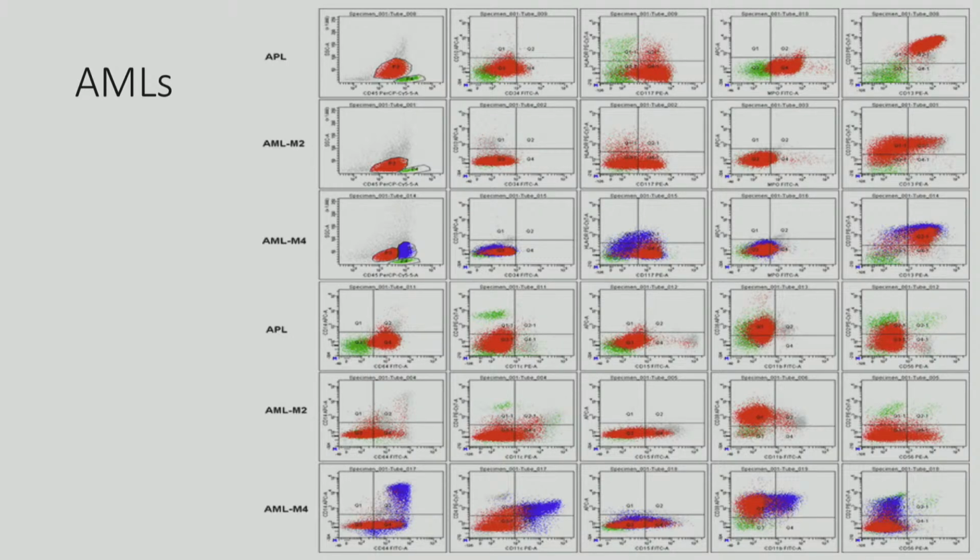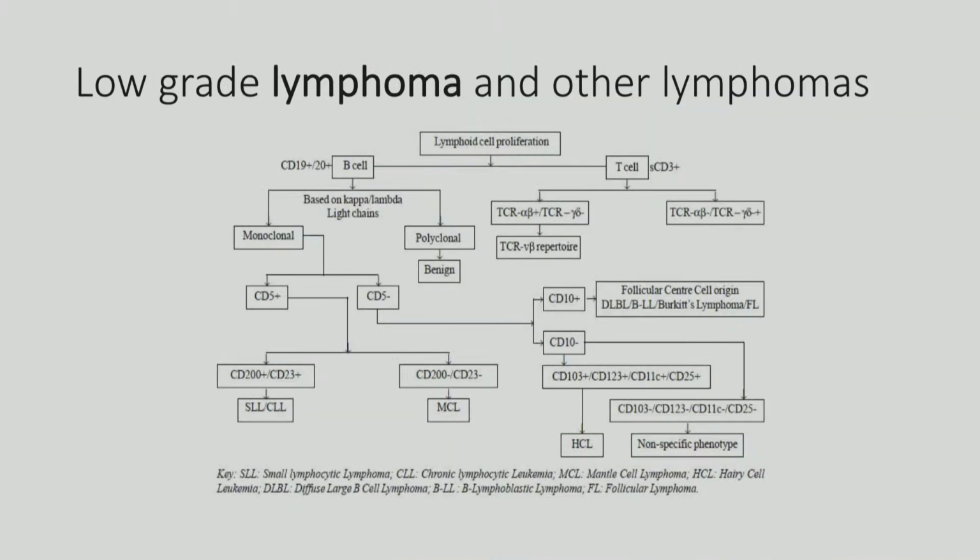But we can have clues of different leukemias, and flow cytometry needs to be interpreted along with genetic analysis. Say we order a cytogenetic analysis, basic karyotype, fluorescence in situ hybridization, and nowadays various PCRs are used, plus clinical exome sequencing is also available, which we call next generation sequencing in clinical situations.